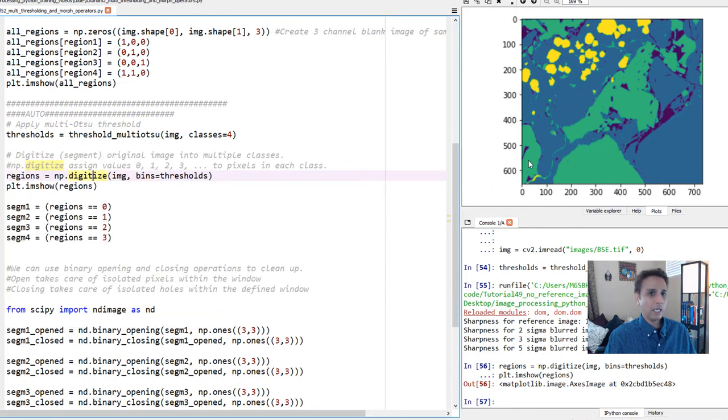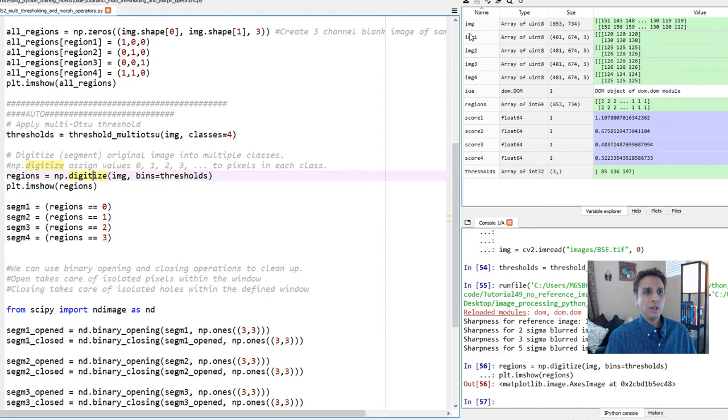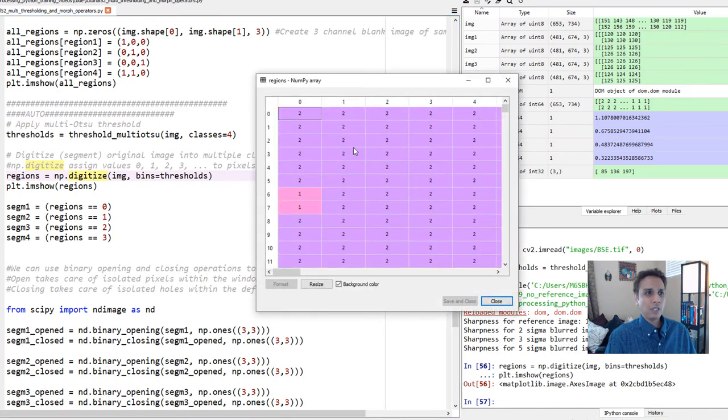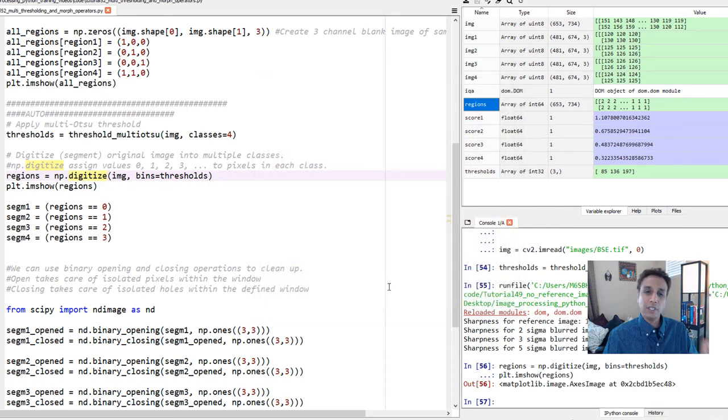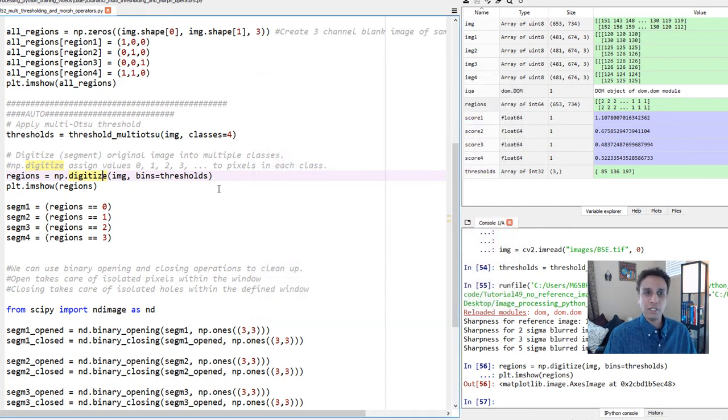Let's look at the plot, and there you go. It's digitized. It looks like this image we did before, but much better. In this case, the values are automatically coming from np.digitize. If you look at our regions, the values are 0, 1, 2, 3. For each region, it's assigning a value of either 0, 1, or 2, or 3. So this is a great segmentation.